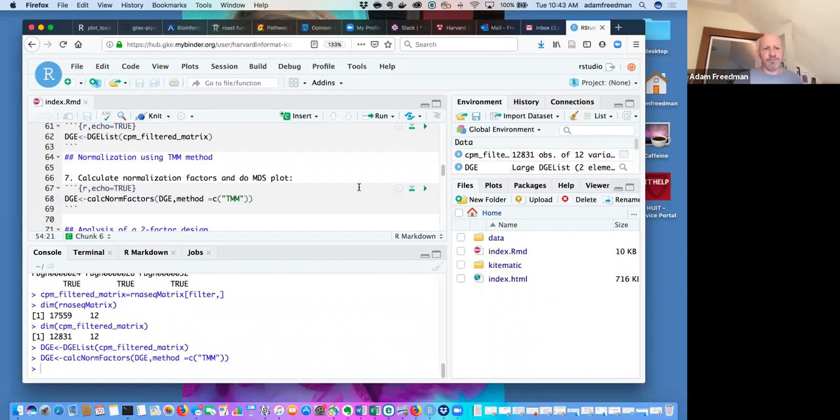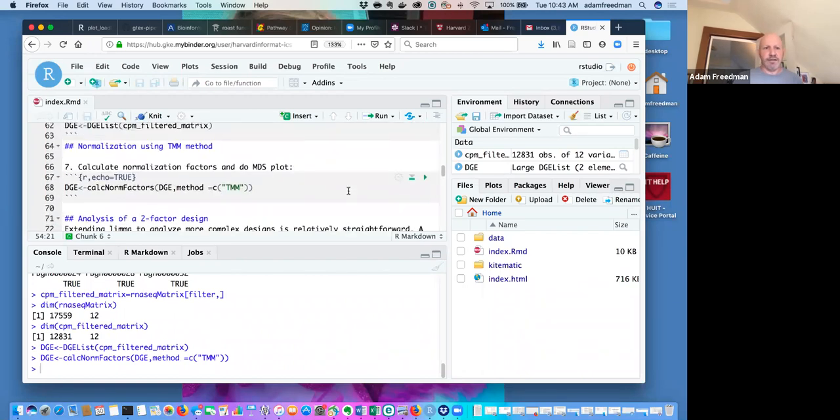Okay, it takes a minute or two, not even. And then, okay.